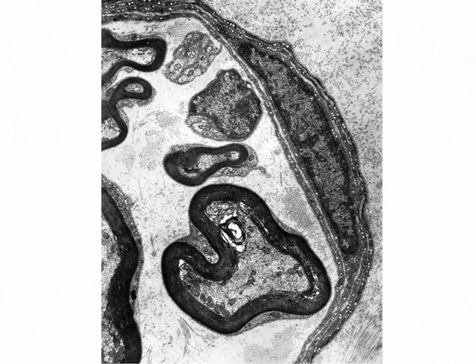Now we're at high magnification electron micrographs. You can only see parts of cells. Here is a myelinated axon. Here's the myelin. And in the middle, you see mitochondria. And in cross-section, you see small structures. These would be either microtubules if they have a hole in the middle, or they would be neurofilaments, which provide structure to the axon, and also the microtubules are the way that organelles and vesicles get transported up and down the axon.